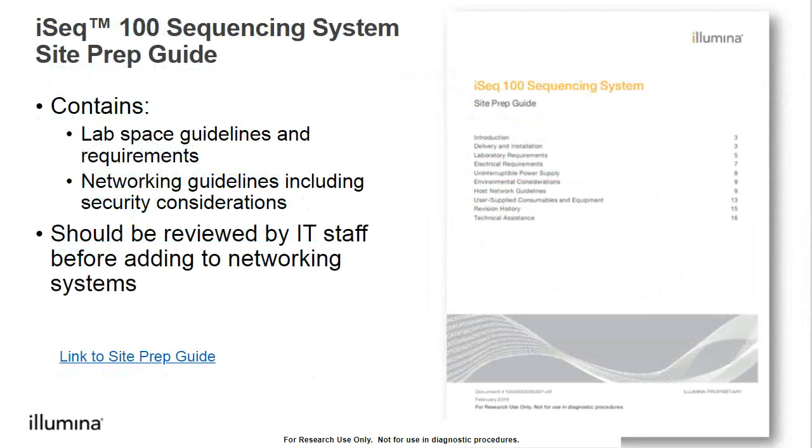Next is the Sequencing Systems Site Prep Guide, and I really wanted to highlight this one as a great resource, one, just for figuring out a great place to set the iSeq 100, but two, it's a really great place to work with your IT team on how to network this iSeq 100 Windows 10 computer. I highly recommend reaching out to IT, and if you are going to send this on a network or put this on the internet, working with them to make sure that it is managed appropriately.